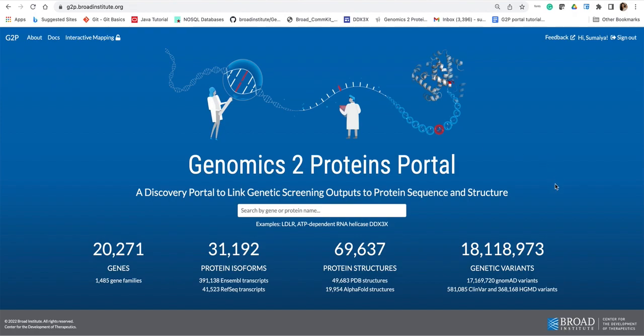In the past months we have received a good amount of questions regarding whether it is possible to analyze mutations and features of non-human proteins, for example viral proteins, using the portal. This use case will be the focus of our today's tutorial.